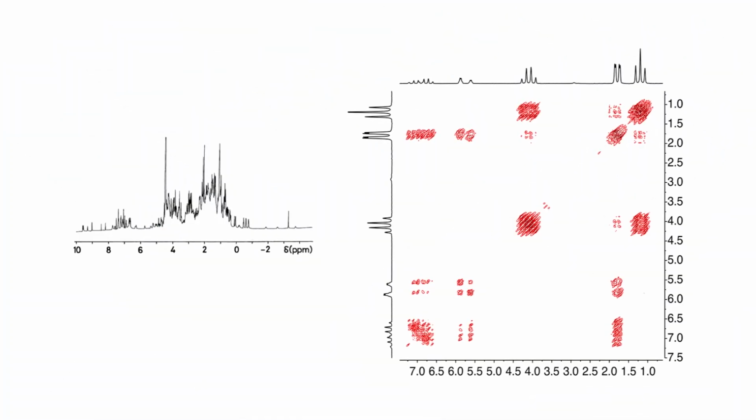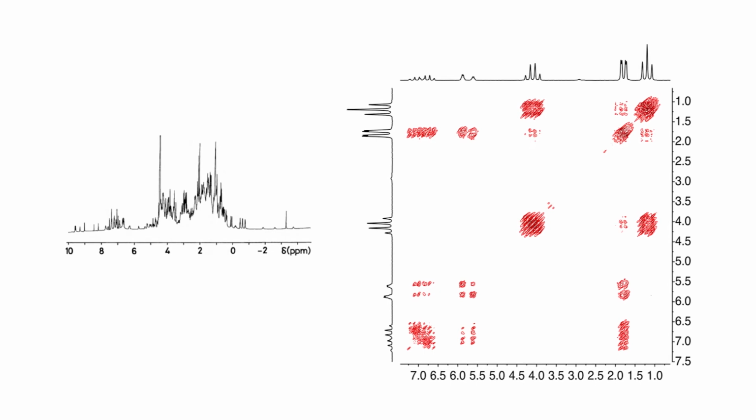The NMR that we have in this lab is an EFT 60. This allows users to do rapid collection of one-dimensional and two-dimensional hydrogen-1 and carbon-13 spectra.